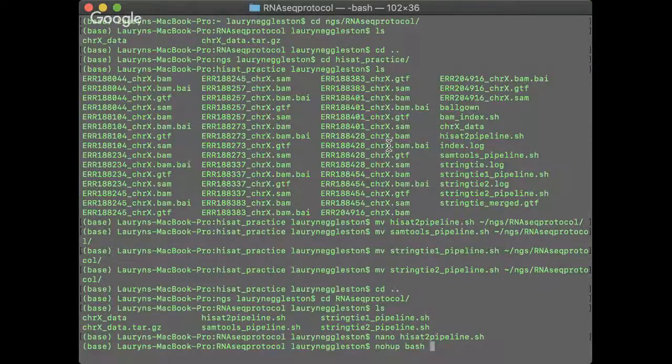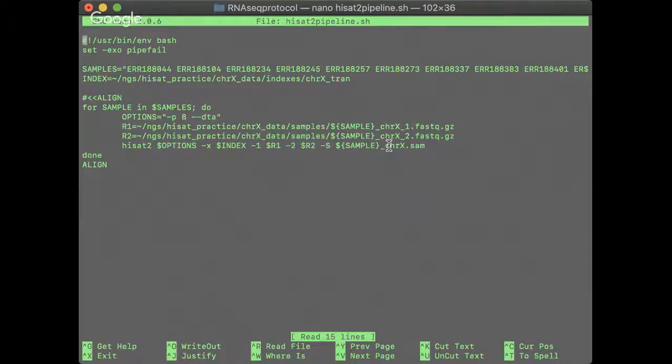So let's just run this in the background. But actually, first I want to make sure that I changed the location.